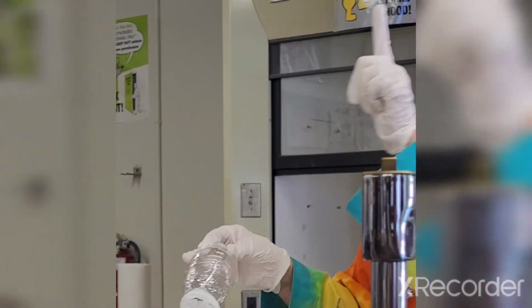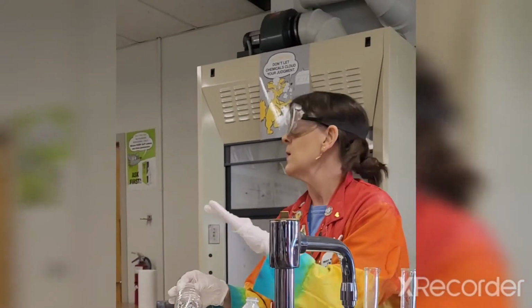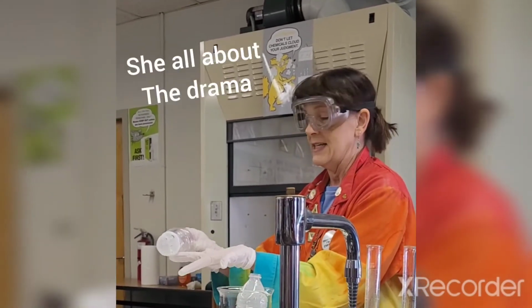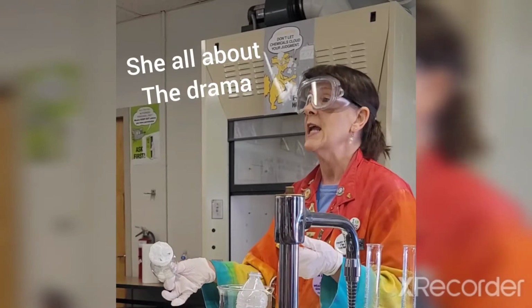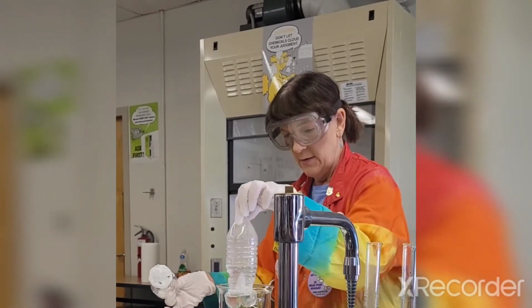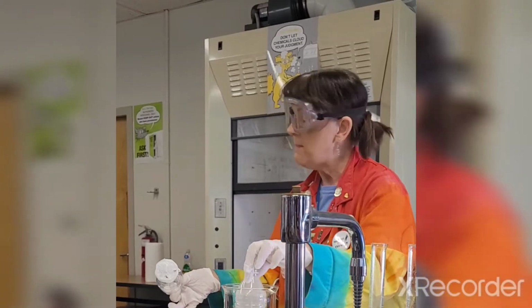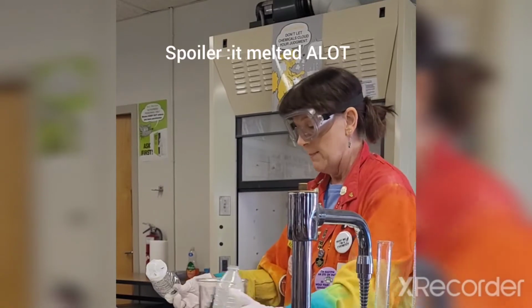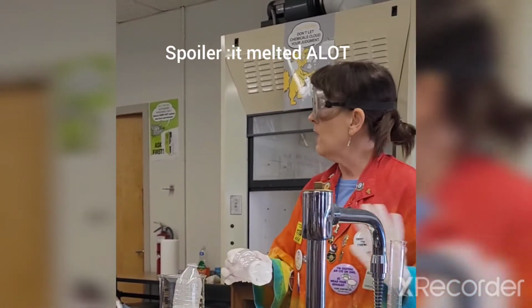Once again, if you're a lab assistant, you would do this. I ain't gonna make you do this. But I think it's kind of dramatic, right? It's kind of interesting to see what it does. That's a lot of heat if it can melt the plastic like that. So I thought I would show it to you. It's still holding on so far. Maybe this one will not break apart. Maybe this one will be the one that lasts. But I'm just going to set it right here while we do our other demonstration, and we'll see.